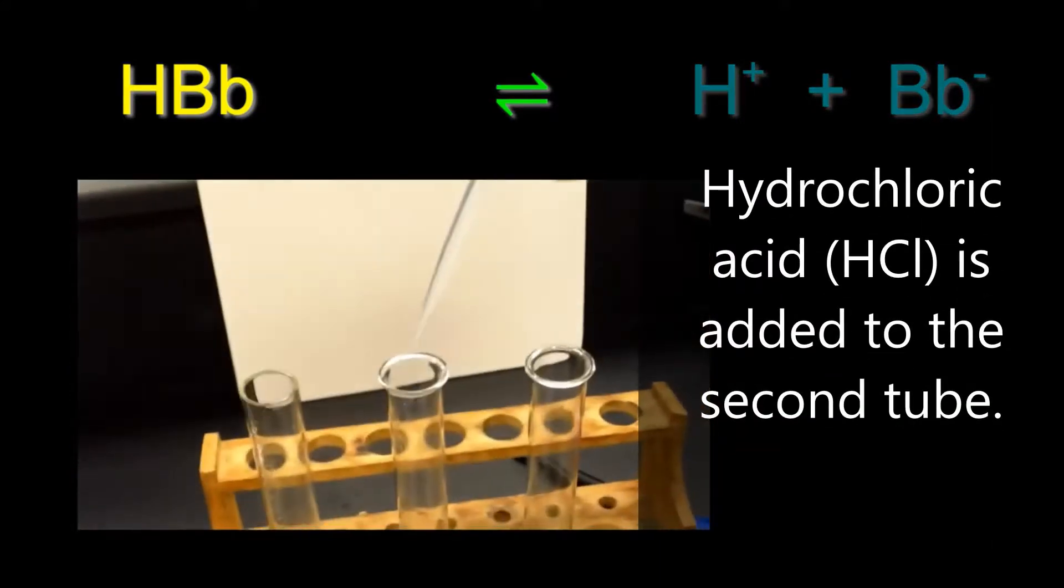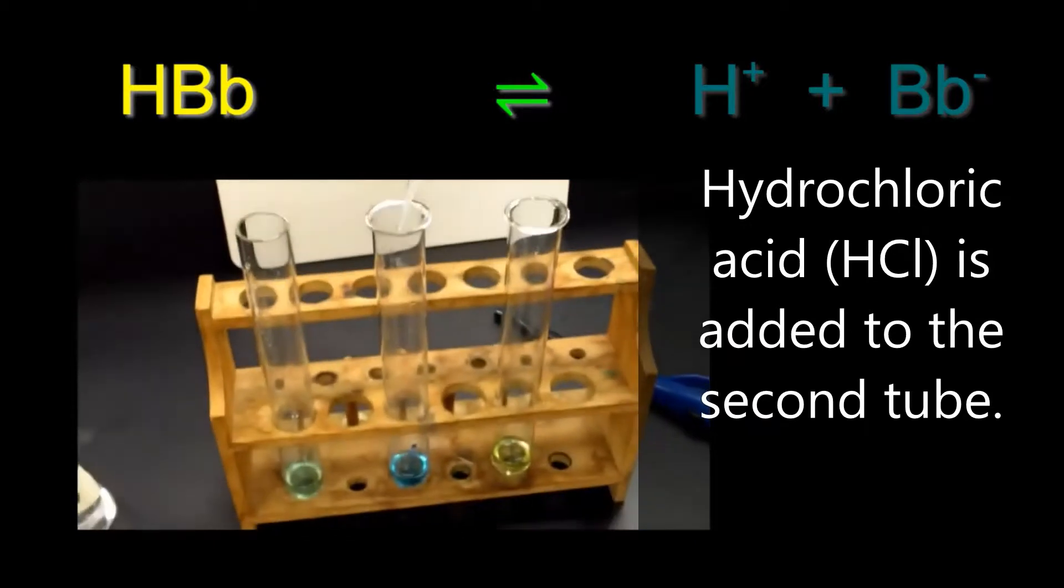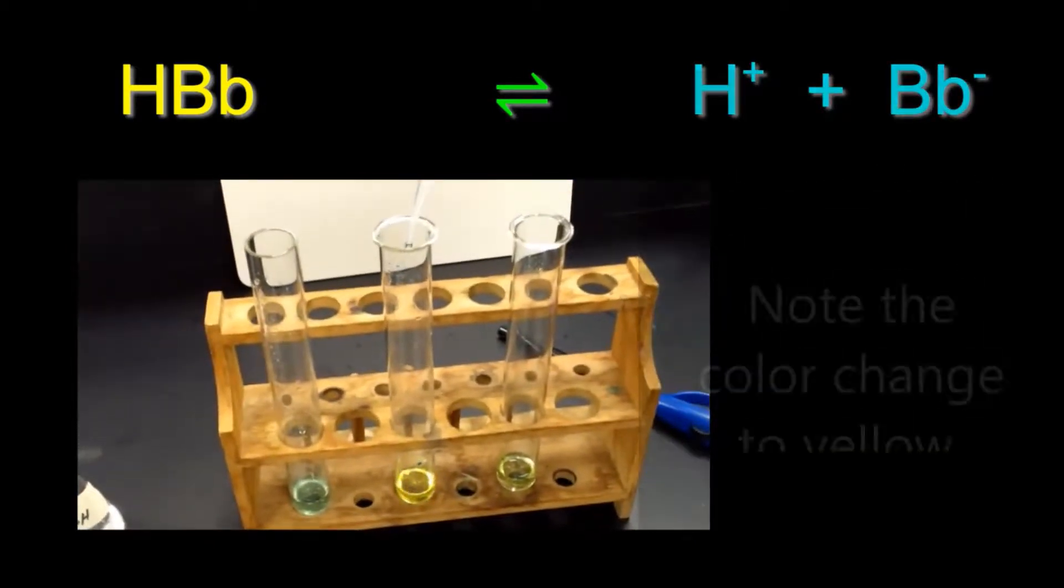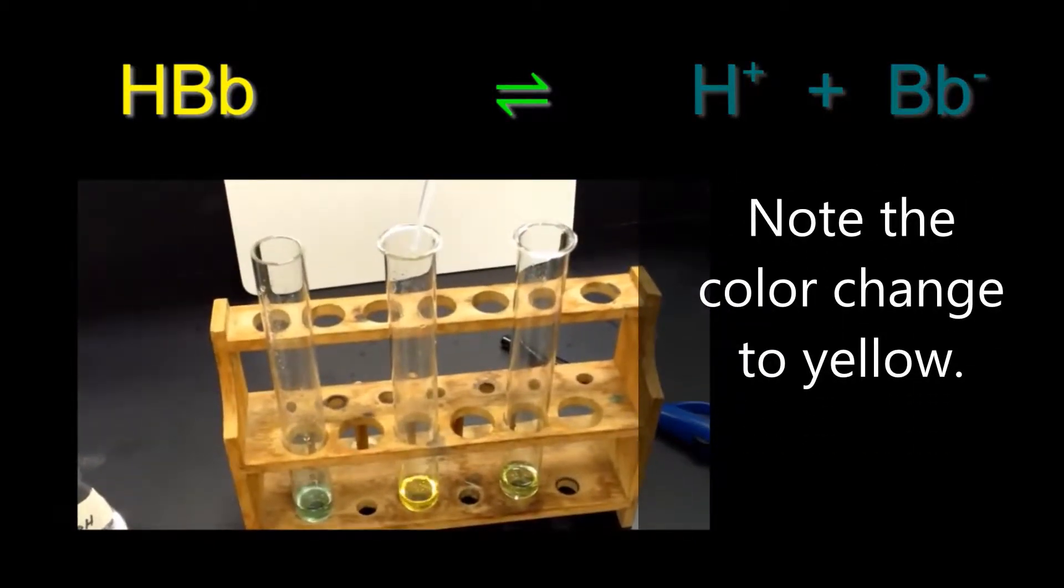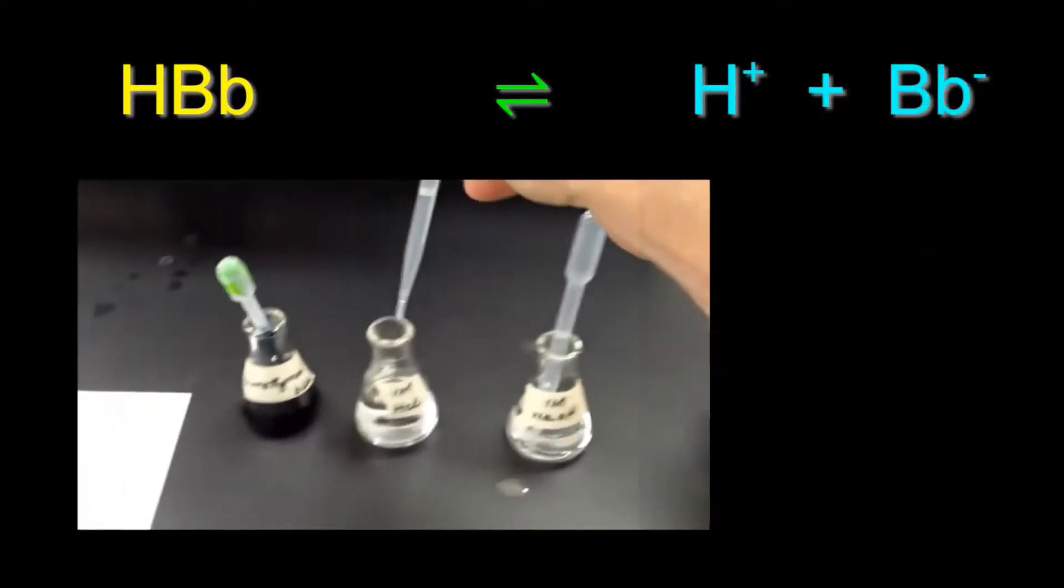Next, we'll add hydrochloric acid, HCl, to the second test tube. Notice that the color in the test tube turns from blue to yellow.